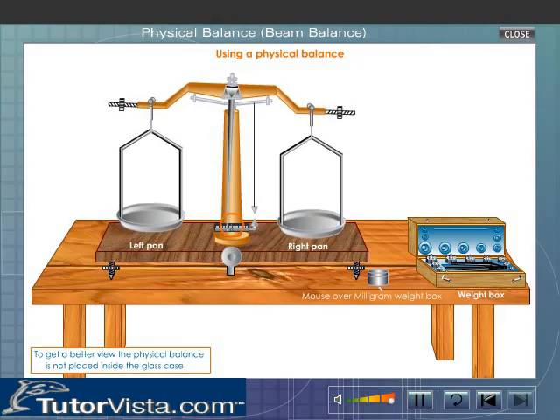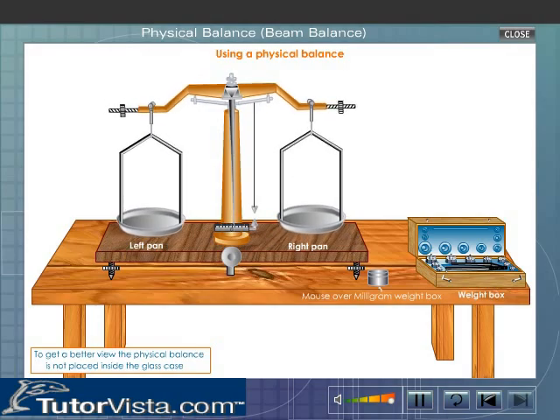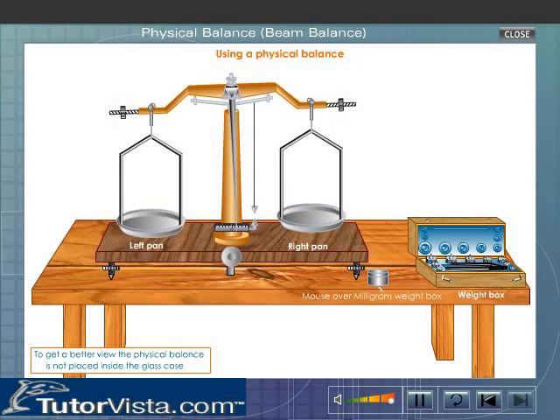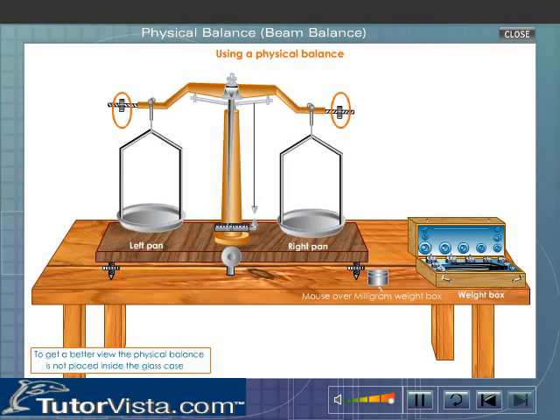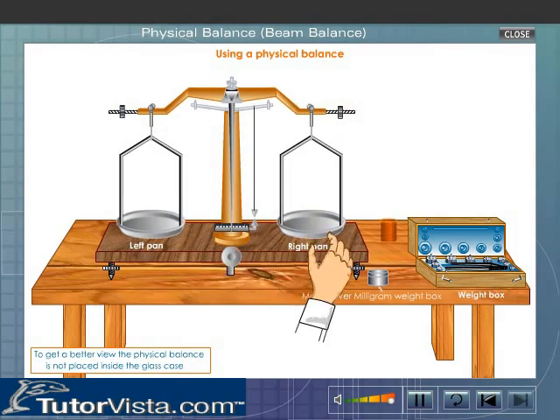However, if the pointer swings more in one direction, then adjust the balancing screws such that it swings equally on either side of the zero mark. Lower the central rod and place the article to be weighed in the left hand side pan.